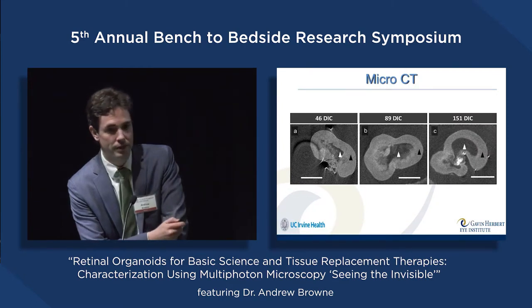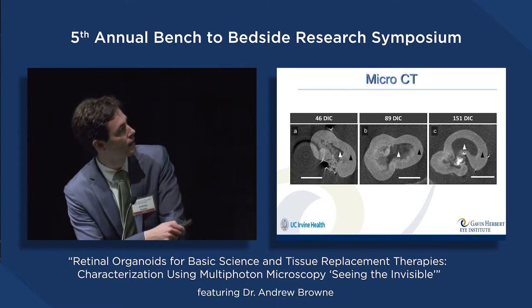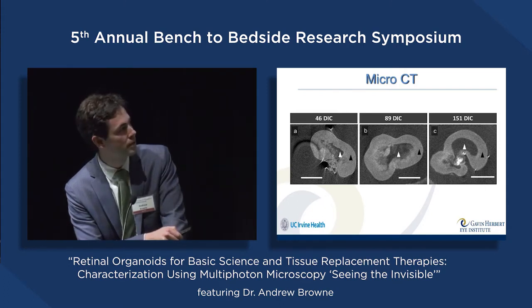Any physician who's ever spent any time in an emergency room knows that everything needs a CAT scan, and so these organoids also needed a CAT scan. And you can see over time that the structures of these organoids, although we can't really resolve too much detail about the layered structure, we get a little bit more information about the inner architecture of these organoids. But it doesn't reveal too much.